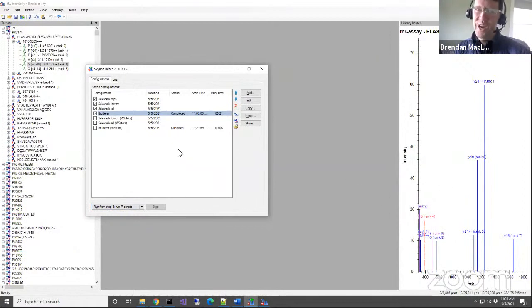So if you're talking about a more complicated queuing system, where you have things queued up and you can say, oh, whoops, I want to run them in a different order, if you want an editable job queue that you can interact with, that's a great idea, but it's not something that's implemented.